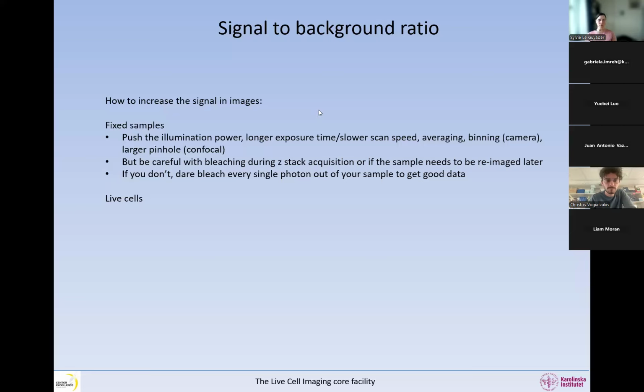So you will have to check, because you will need to go back to your microscope and re-image and try to explore the settings so that you can lower the noise. So we'll see what comes out of that. Yeah, but that's clearly a valid point as well.